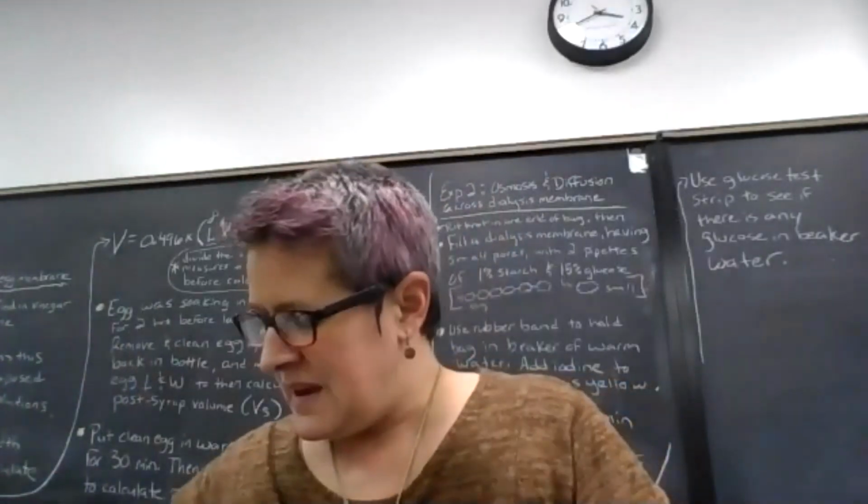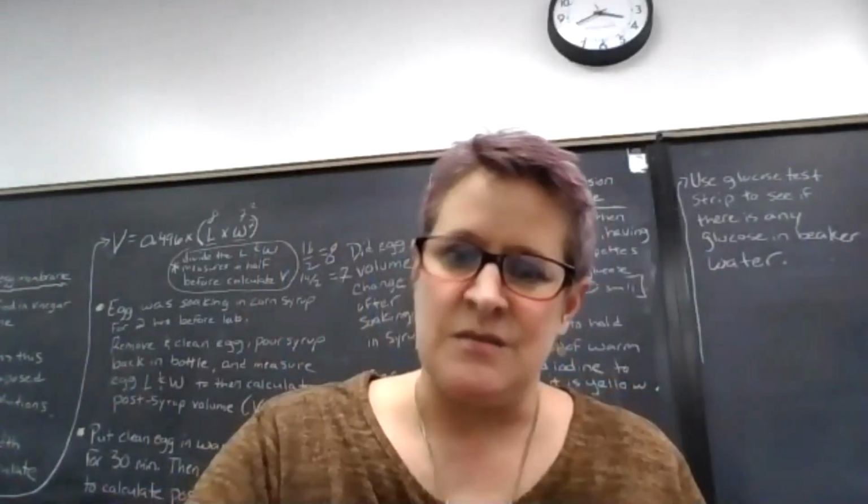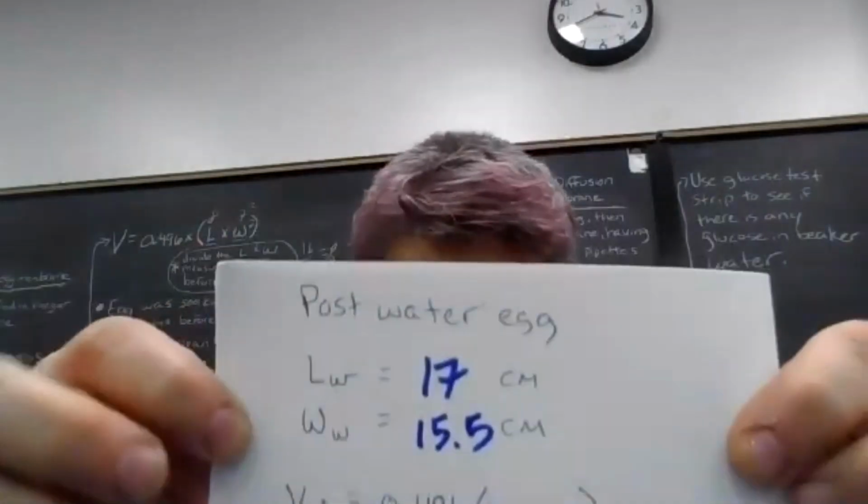Nope, grabbed the wrong one. Ha ha ha. See, I was testing you. Passed, barely.